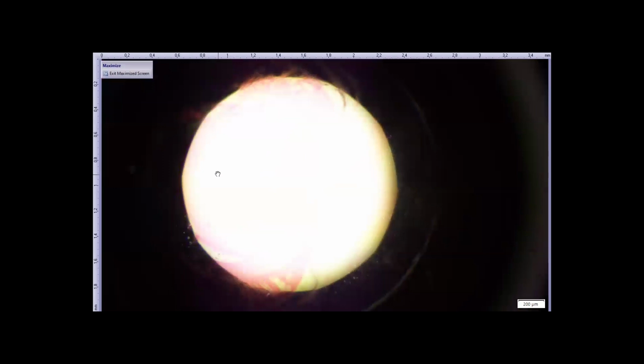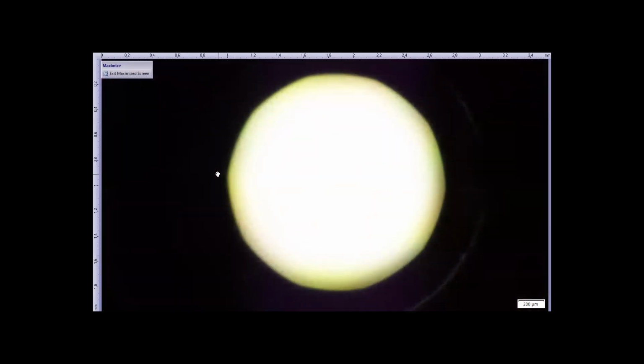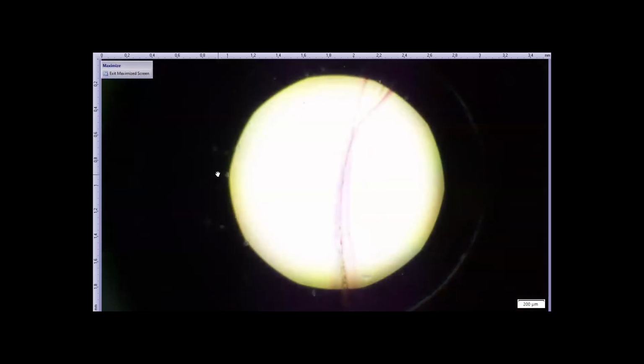And then I have another section of a chameleon, which is more centered on the back of the eye. You sure? Won't break it. It's okay, still intact.